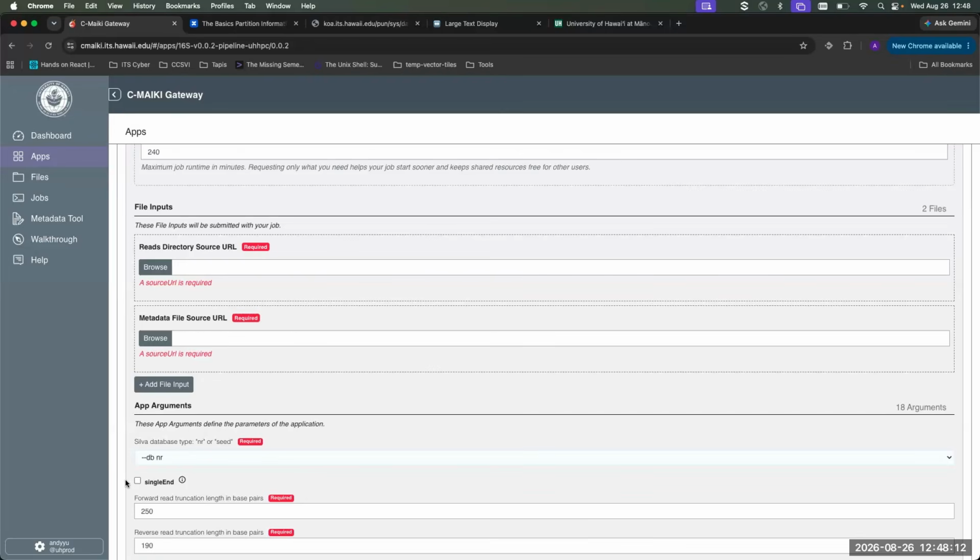I'm happy to show you how to do command line if you want to do totally different primers with amplicons. And I'll talk more about that with the Ampliseq pipeline because it's very flexible and has lots of different pipelines. Gotcha. Thank you. If we wanted to add an app, how do we do that?